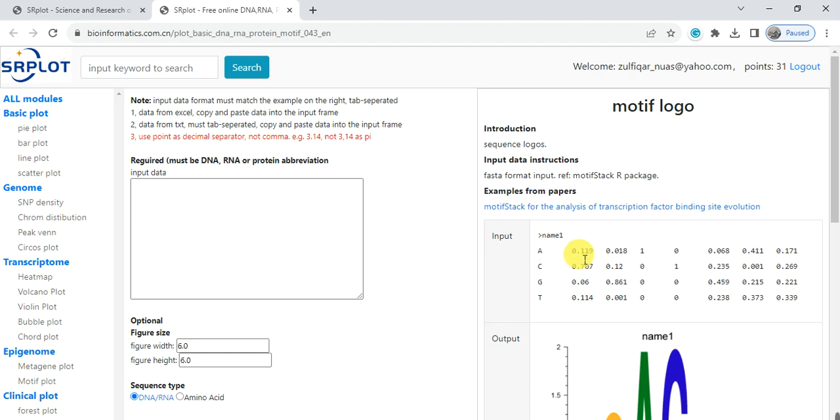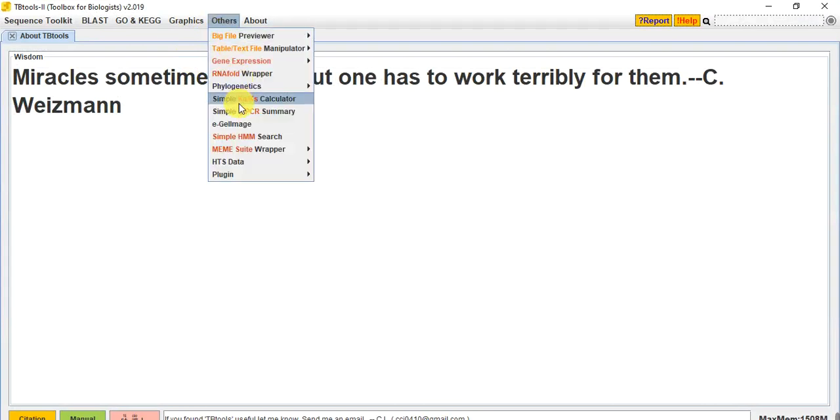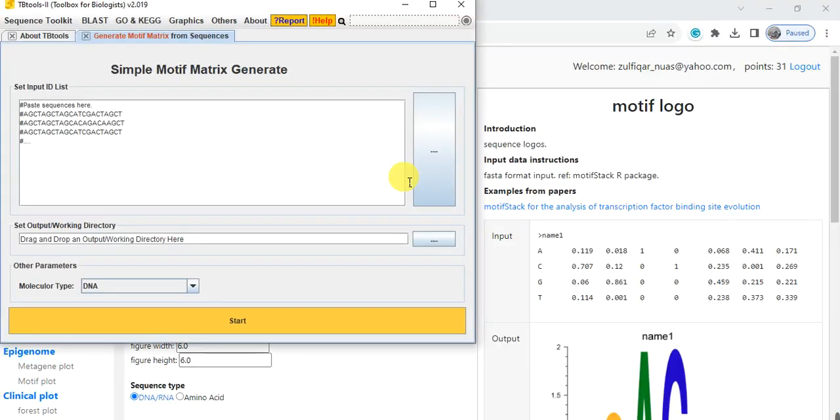For this we need to work on TB Tool. Go to TB Tool, Others, MEME Suite Wrapper, Generate Motif Matrix from Sequence.